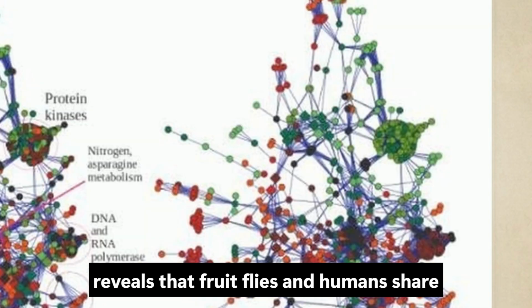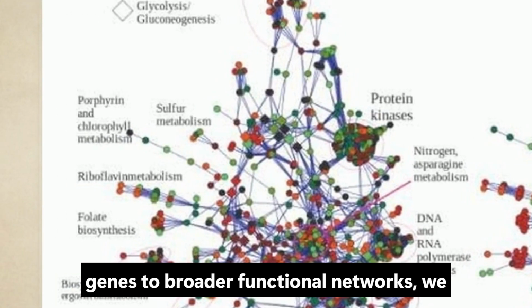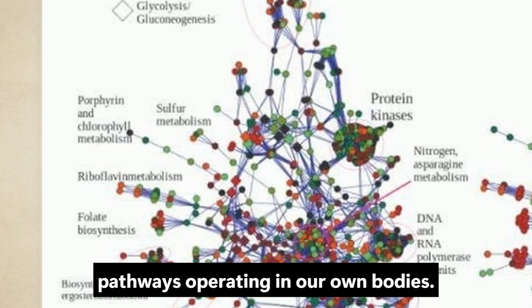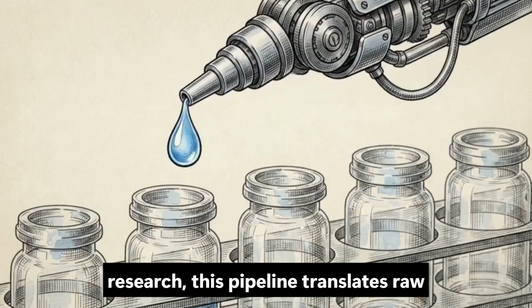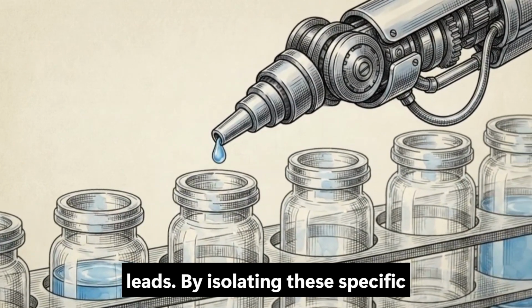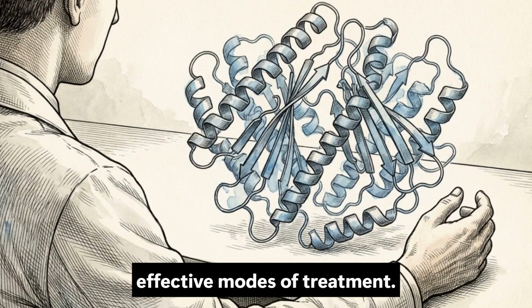Analysis of these genomic sequences reveals that fruit flies and humans share significant genetic similarities, including genes linked to complex diseases. By mapping these identified fly genes to broader functional networks, we observe the same metabolic and regulatory pathways operating in our own bodies. These findings are uploaded to public repositories for the global scientific community and synthesized into published research. This pipeline translates raw tissue into a targeted list of metabolic leads. By isolating these specific genetic responses in the lab, researchers can identify the functional units of disease and begin developing more effective modes of treatment.